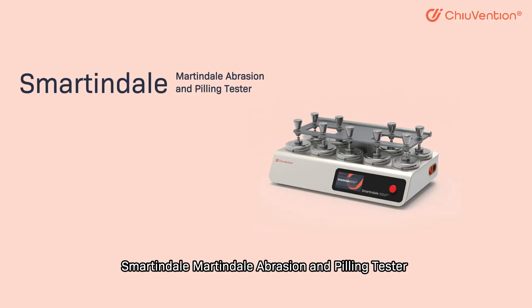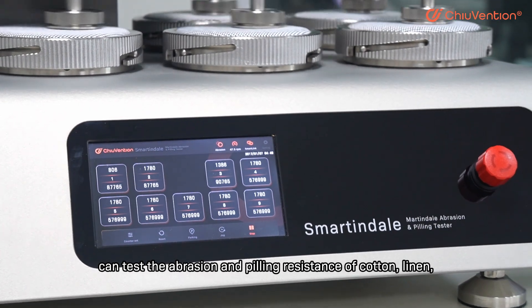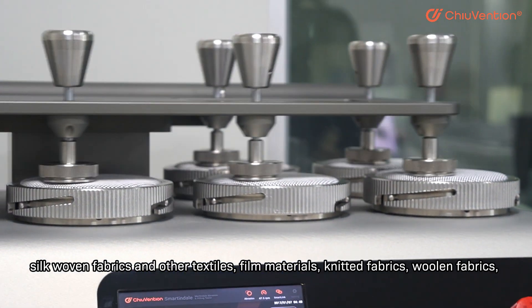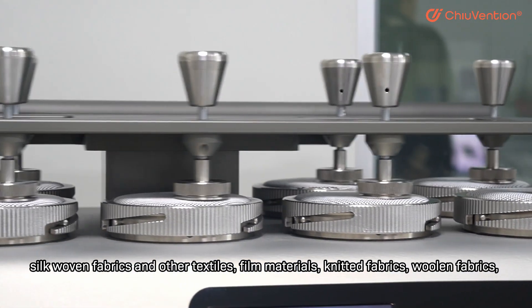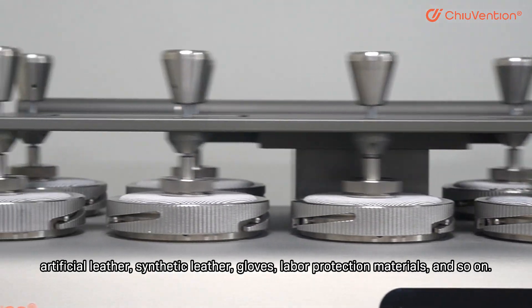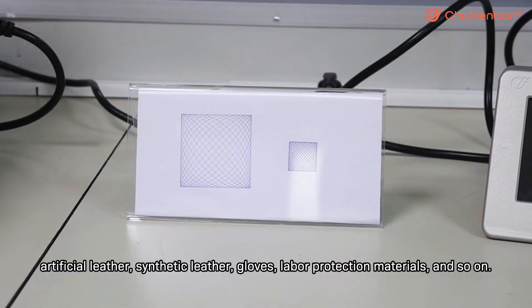The Smartindale Martindale abrasion and pilling tester can test the abrasion and pilling resistance of cotton, linen, silk, woven fabrics, and other textiles, film materials, knitted fabrics, woolen fabrics, artificial leather, synthetic leather, gloves, labor protection materials, and so on.